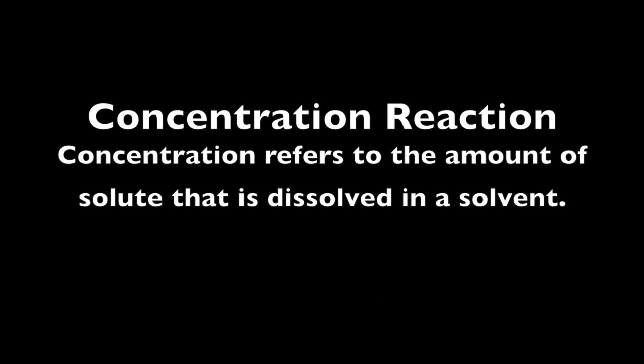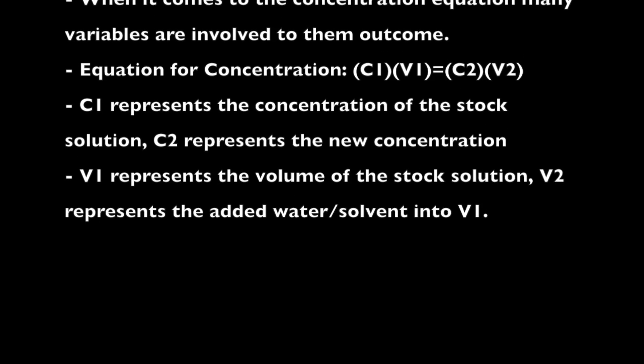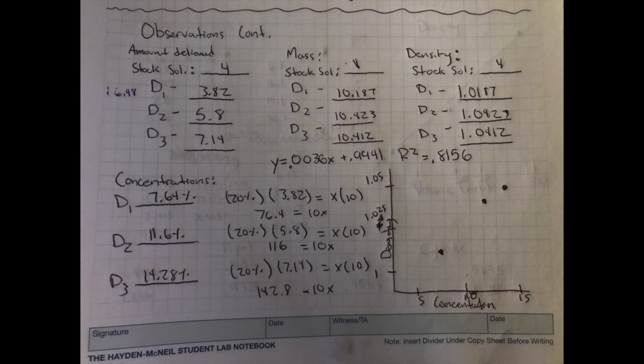A concentration reaction is the variables of the concentration equation that are involved in this experiment and our data that we found with the concentration equation.